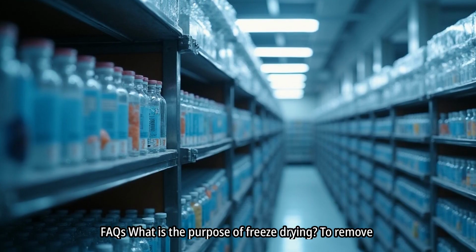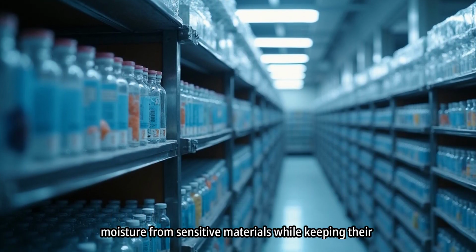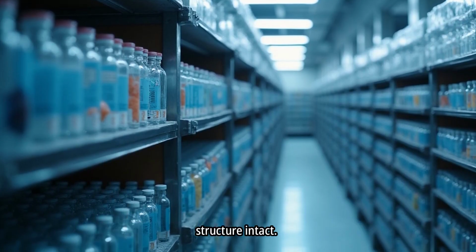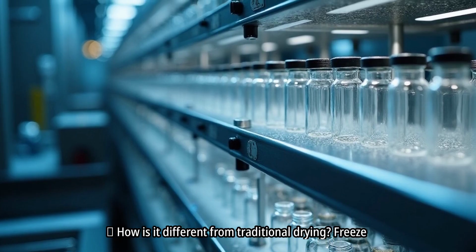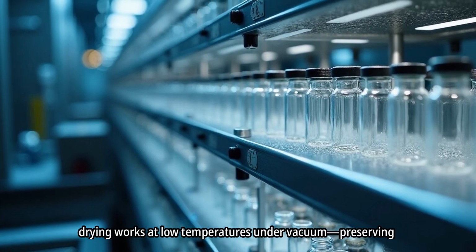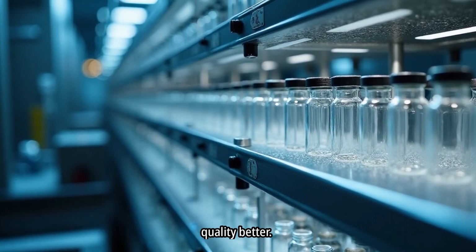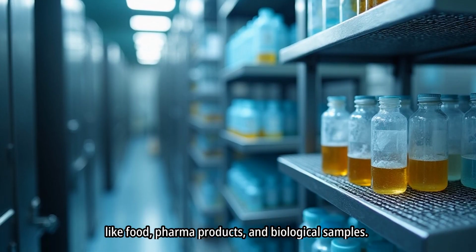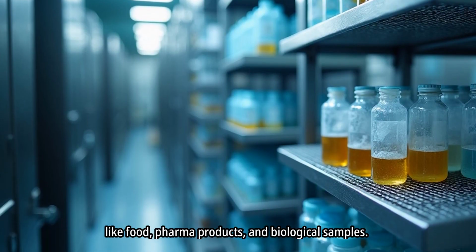FAQs. What is the purpose of freeze drying? To remove moisture from sensitive materials while keeping their structure intact. How is it different from traditional drying? Freeze drying works at low temperatures under vacuum, preserving quality better. Can all products be freeze-dried? It's best for items like food, pharma products, and biological samples.